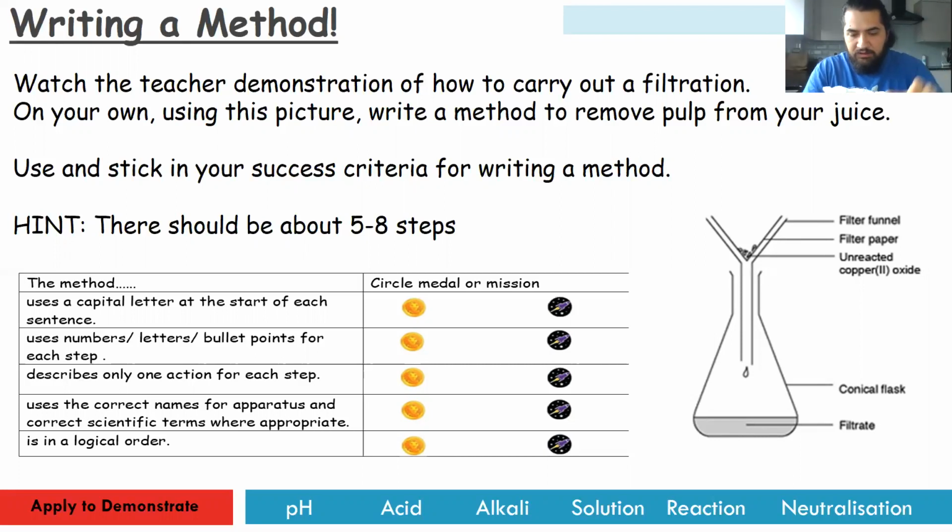Dry some of the water that's spilt around the side. Okay, so here at the bottom I have clear water compared to the muddy water that I had. You can see the difference. And I'm going to show you on the top of what should be filter paper. Okay, you're left with all the dirt and all the bits that are filtered.